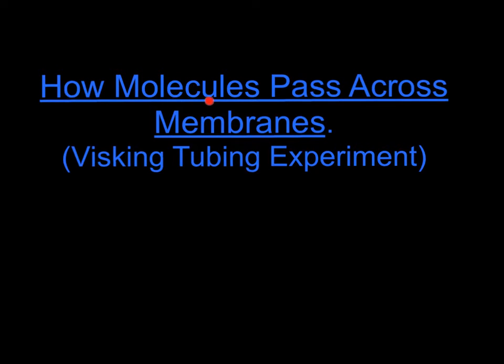How molecules pass across membranes. We can do an experiment using Visking tubing, which imitates what happens in the second half of the small intestine. It has tiny microscopic pores in it, which do not allow large molecules through, but do let small molecules cross into the blood.